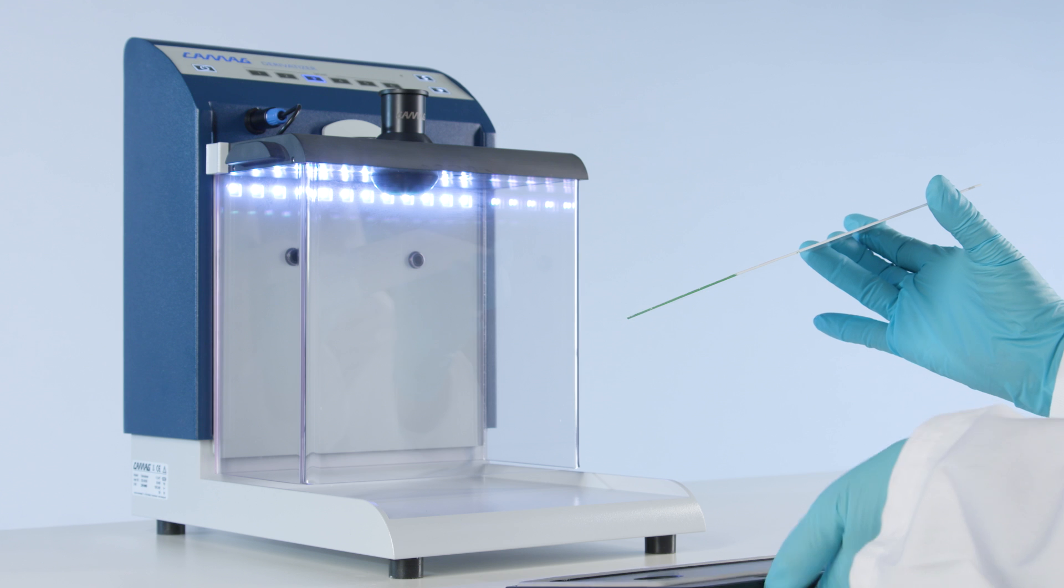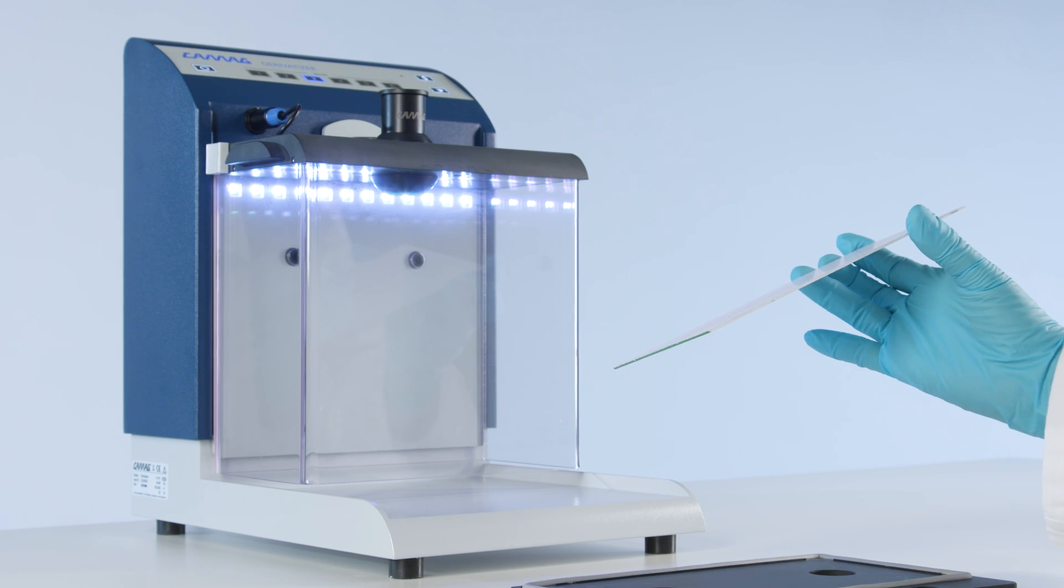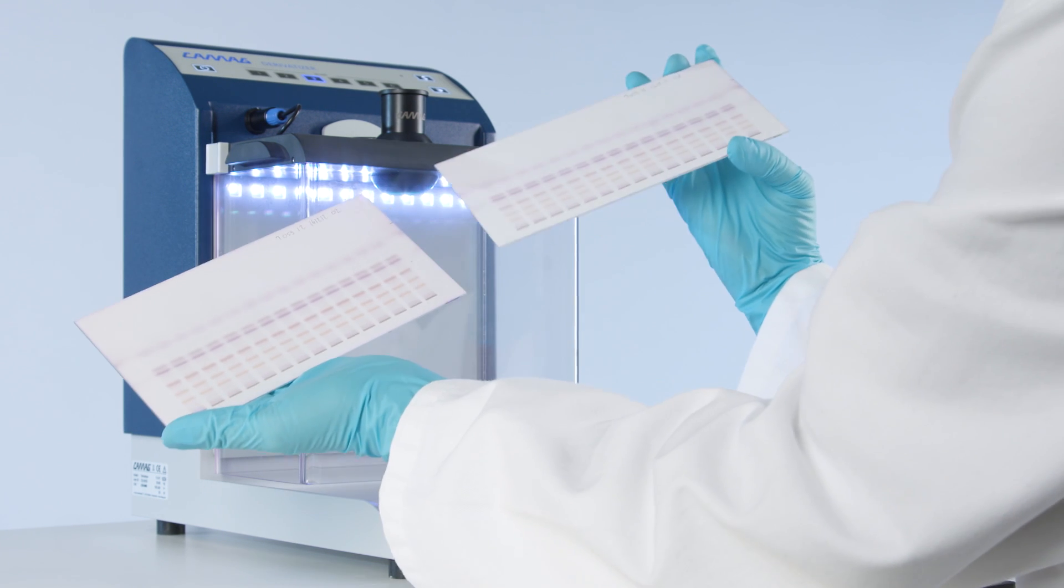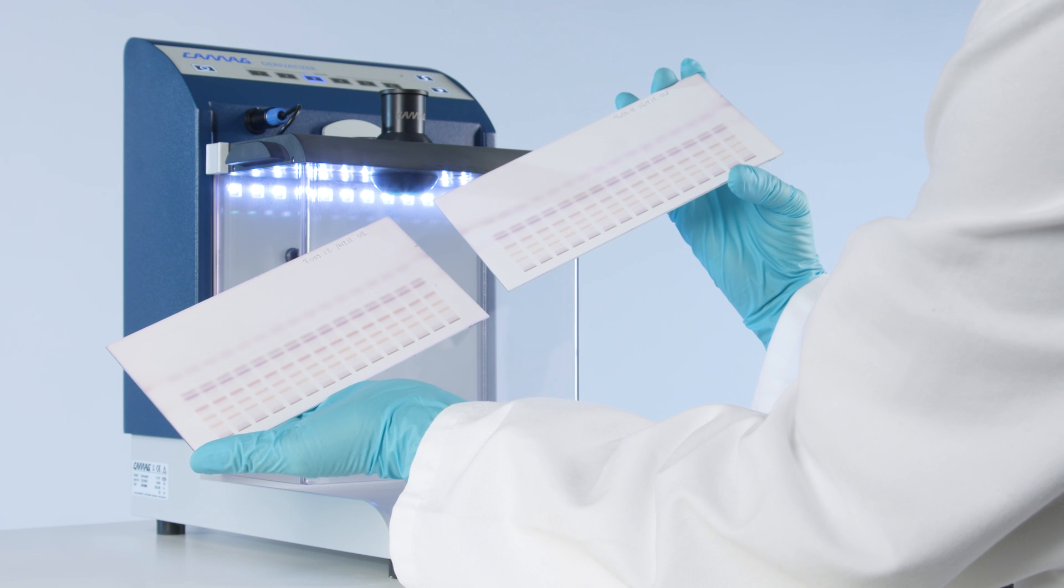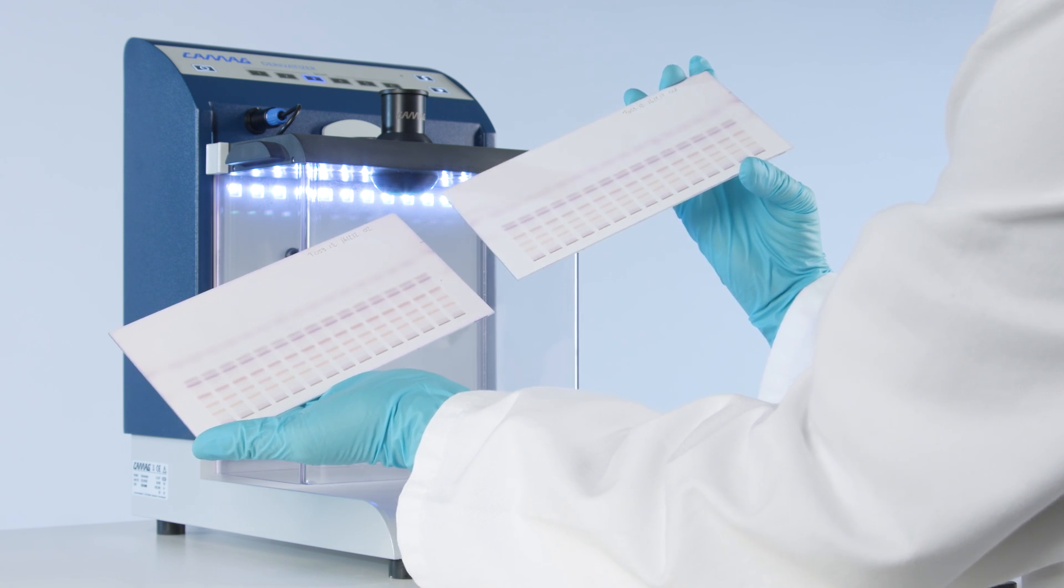Visual observation of the plate shows very high homogeneity. Reproducible and user-independent results are obtained from plate to plate.